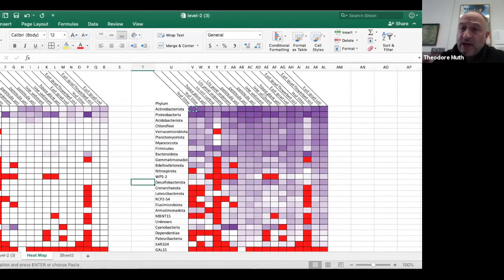And so when I don't sort for abundance, if you remember that first graph, the abundant squares and the zero squares were all spread over. So the sorting is critical, but I would direct you to that StatsQuest video. It's going to do a better job than I can, and I just didn't prepare to do that during this session because there were some other things I wanted to show, but it's an excellent question.